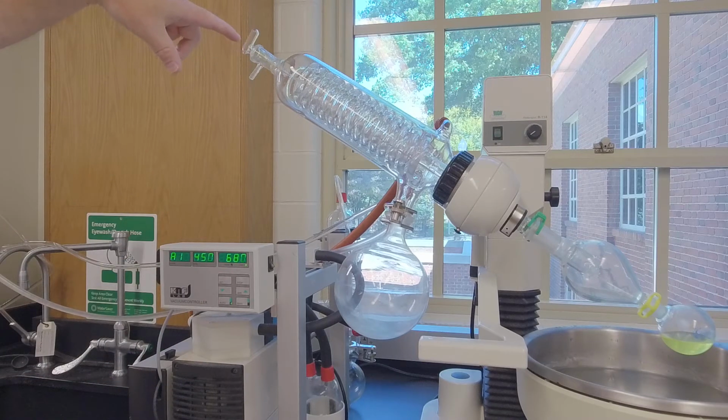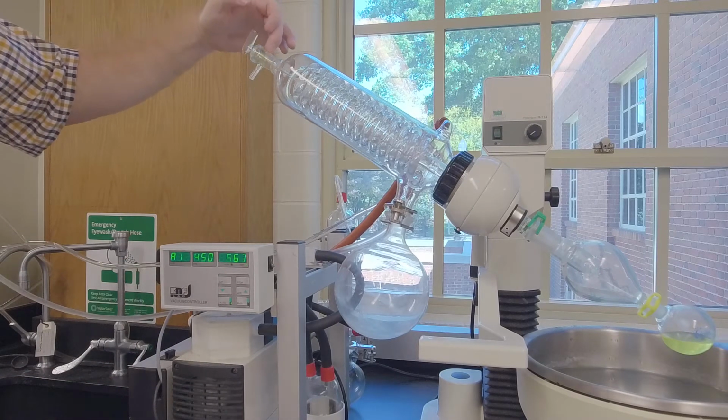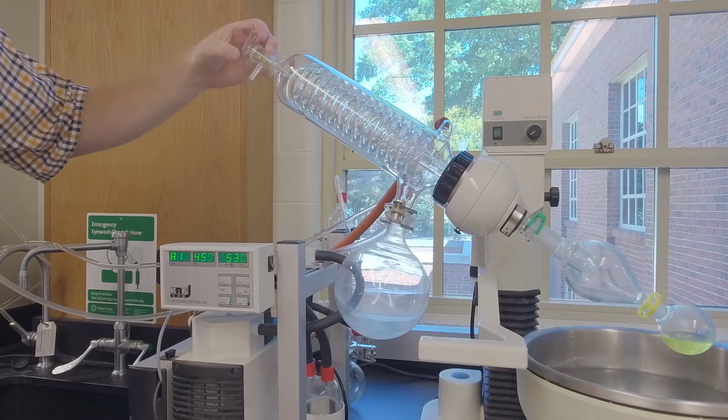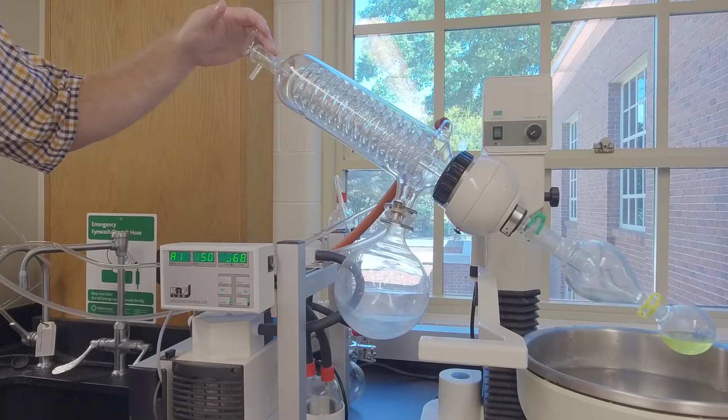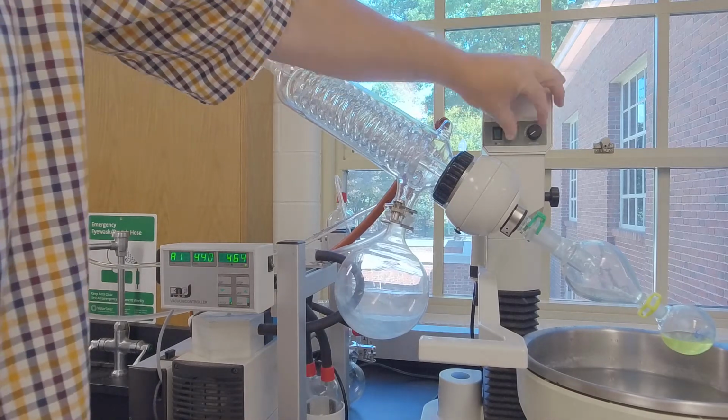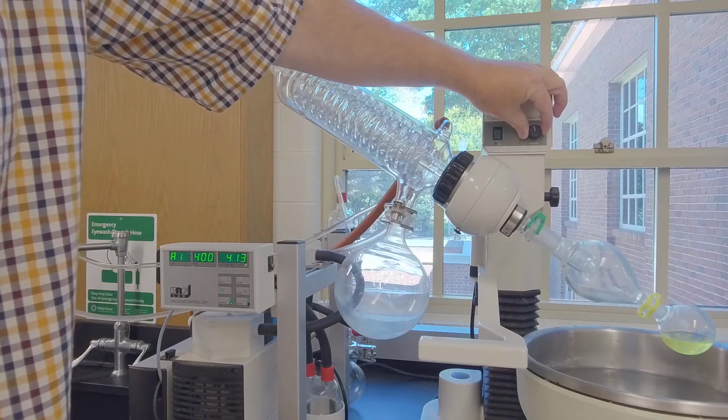You hear that hiss? All right, it's pulling vacuum, creating a sucking sound there. I'm going to close this. And then I'm going to spin the flask.